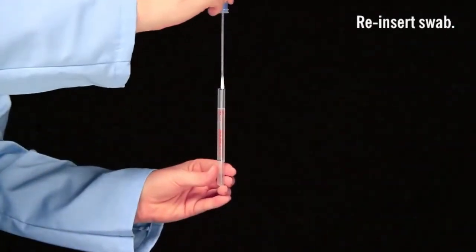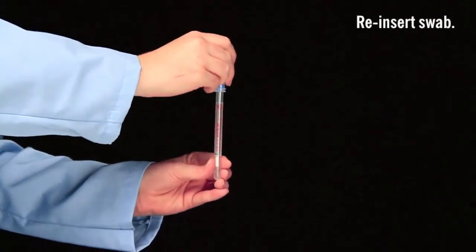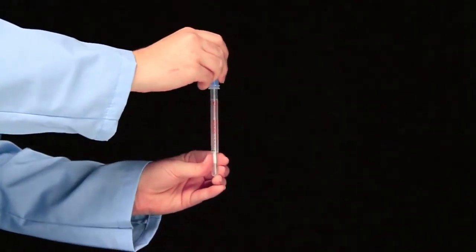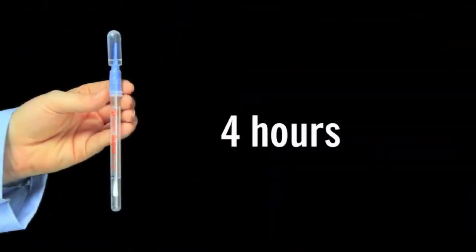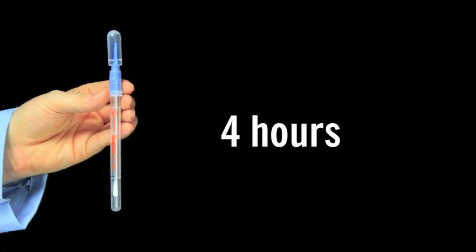Replace the swab in the tube. SuperSnap may remain in this unactivated state for up to 4 hours.